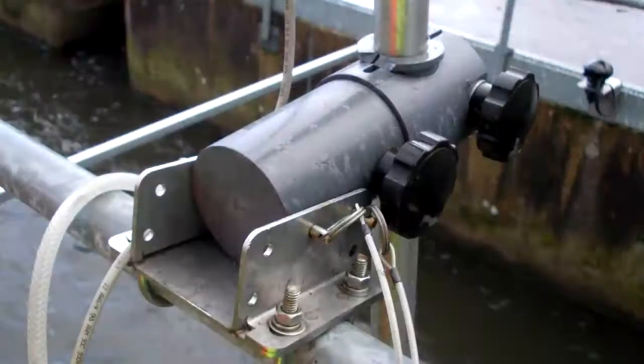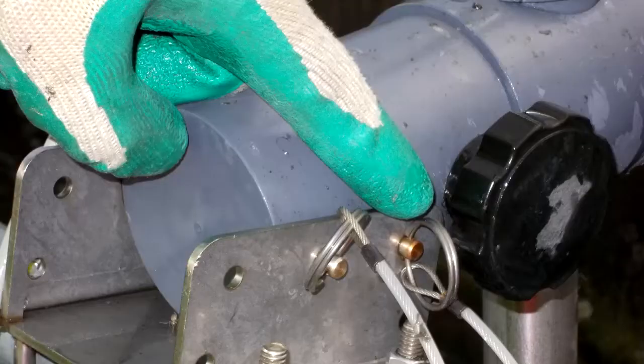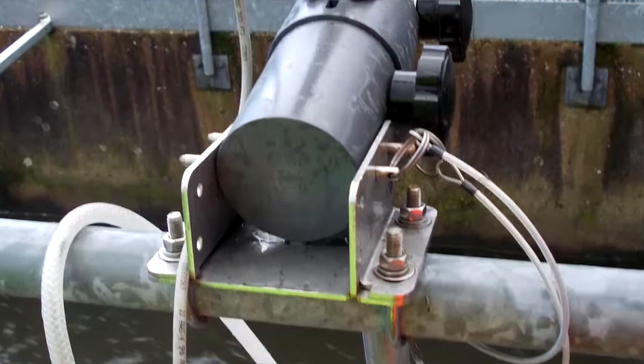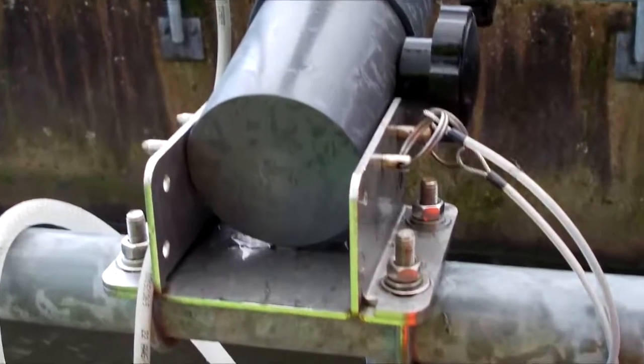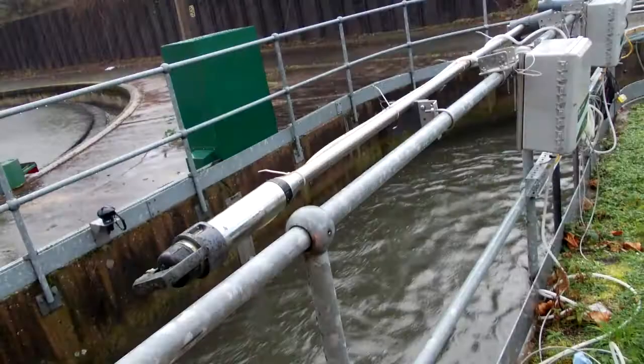For the handrail version, a PVC block attaches to the handrail fixing plate via two fixing pins. For the second pin you have a choice of holes in which to insert the fixing pin, which enables the customer to choose the angle that the LDO probe is set at. The mounting pole is slotted through the second half of the PVC block. The LDO probe screws into the bottom of the pole and its 10m cable travels up inside the pole and emerges out of the top through a gasket below a threaded end cap.